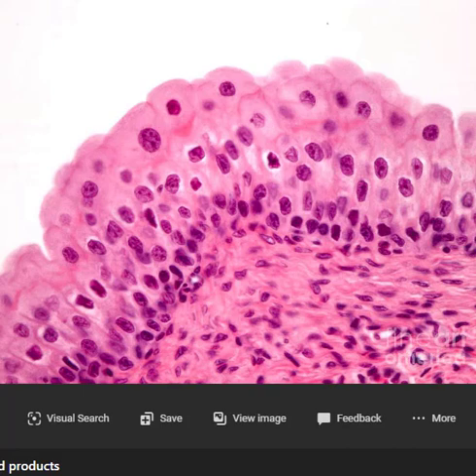What you're looking at in transitional epithelium is columnar cells, but in certain tissues that stretch out and shrink down. Your bladder is a classic example. Think about when you finish peeing and you've emptied your bladder: it shrinks up, it just shrivels up, and it kind of looks like this. If you were to take a slice of your bladder and put it under the microscope, this is kind of what you would be looking at.